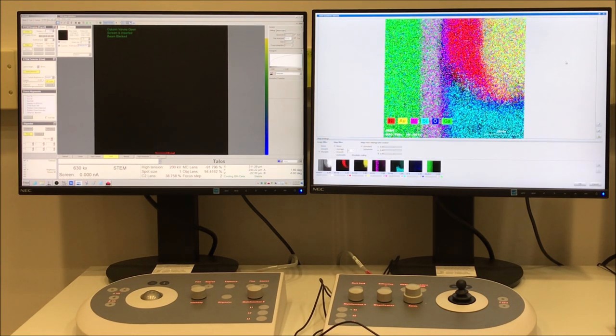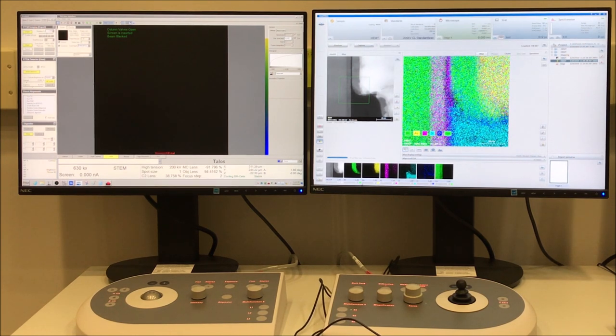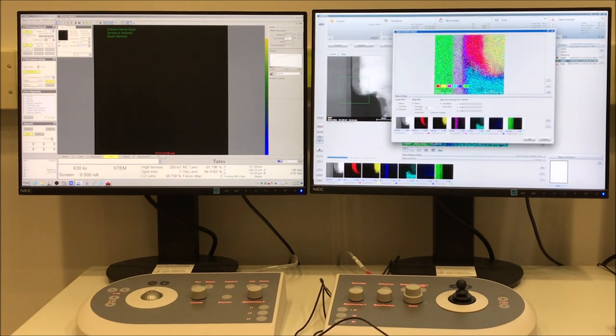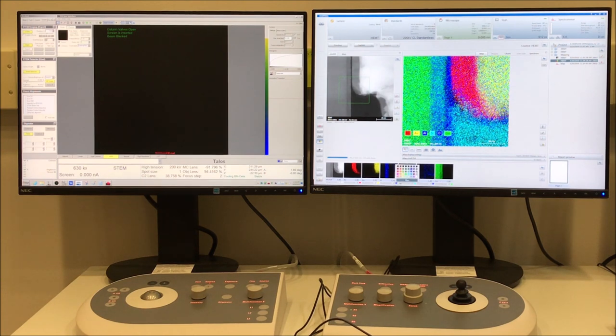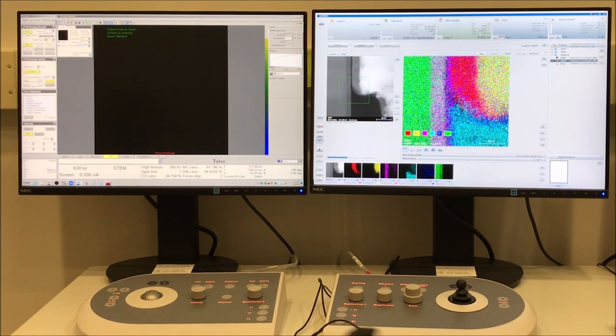So we can see the original color scheme here that looks much better than the other one. So we can just go ahead and quickly rearrange the colors here, which only takes a couple changes here. And then we are ready to go. Again, you can pull up that little settings dialog box and you can remove the scale bars and legend if you want. You can also add in the averaging if you want. Again, I don't like doing that for the maps.